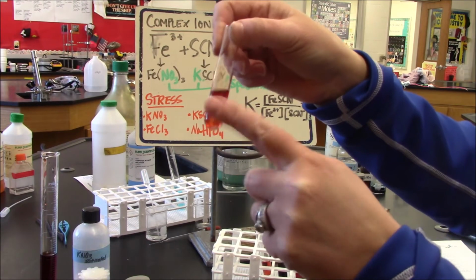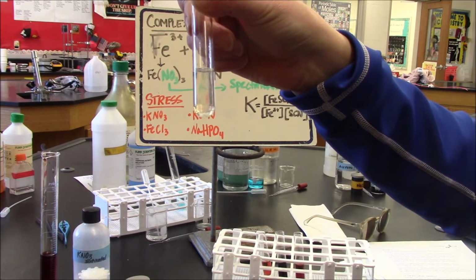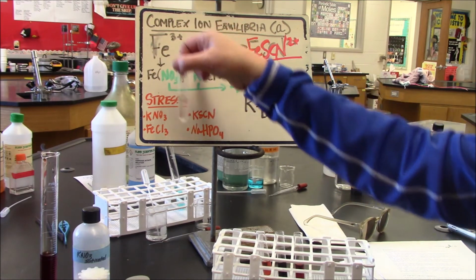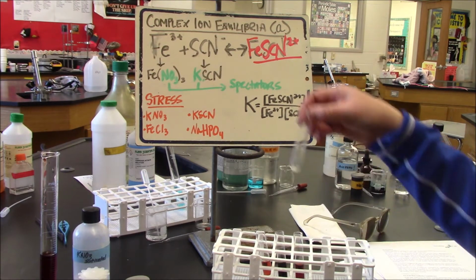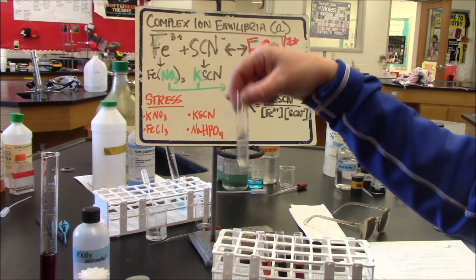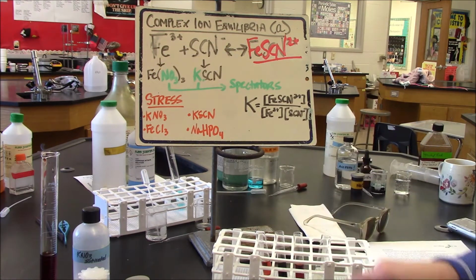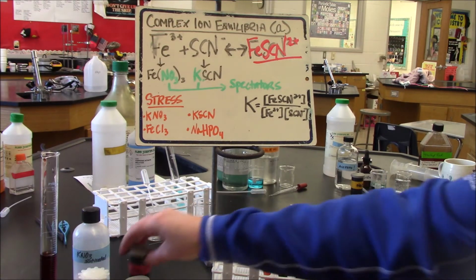You can already start to see at the bottom of my flask that it was changing color, and now it's completely gone in the opposite direction, because I've drawn these iron ions out of solution, and now I just have this transparent thiocyanate ion. Okay? I mean, it's hard to see. There is a pale yellow color, which indicates the presence of some of these ions as they are being produced, but as they are being produced, they're being pulled out of solution in the form of this solid iron 3 phosphate.